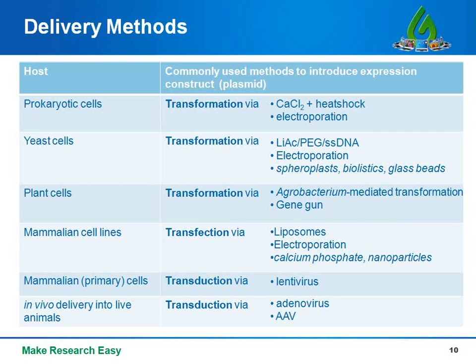There are several viral systems that have been adapted for use in gene delivery. That is, they've been altered so that they can't replicate inside cells or produce pathogenic viral proteins, but these viruses are much more efficient than non-viral delivery methods. Efficiency may not matter much if you're working with a robust cultured cell line, but when you're working with primary cells or animals, efficiency can be critical. Lentiviruses in particular have become a preferred method for gene delivery to primary mammalian cells because they enable genomic integration even in non-dividing cells, such as neurons. Adenovirus typically does not integrate into the genome, but adeno-associated viruses may integrate, and both of those are typically used for in vivo delivery into live animals.